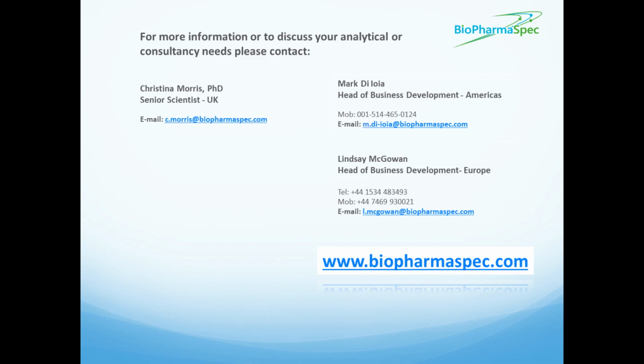We use both Sciex and Waters systems, and for each one, there's specific software, namely Progenesis or the SWATH acquisition micro app. They perform the peak picking analysis and they calculate the areas that are taken forward for the quantitation estimates. These software packages produce large volumes of data, as you can imagine.